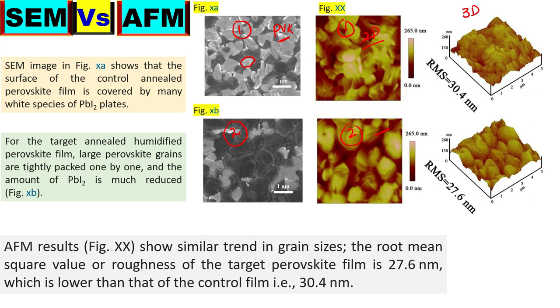And the second important thing, we can see here a lot of white grains, because in sample 2 those white grains are basically disappearing. So this is a good discussion we can write about this. This is the modified film. So what happened, there is a clear indication that these white grains or species are basically disappearing. This is one clear indication. And secondly, we can see that the grain size basically increases. So these are the two clear identifications.